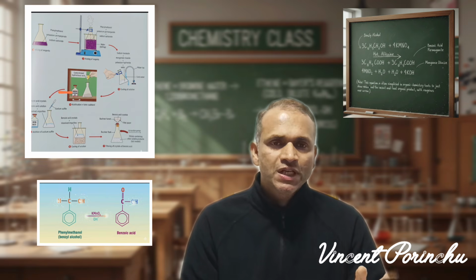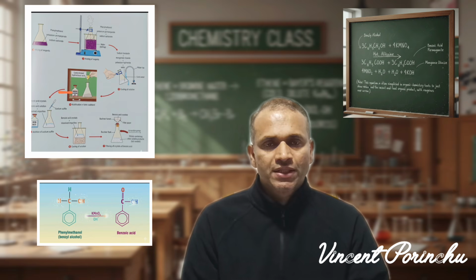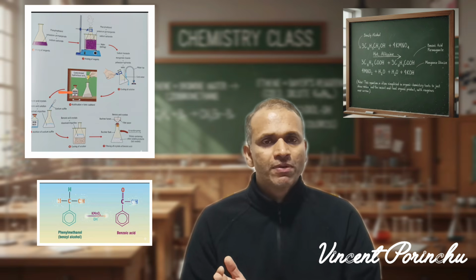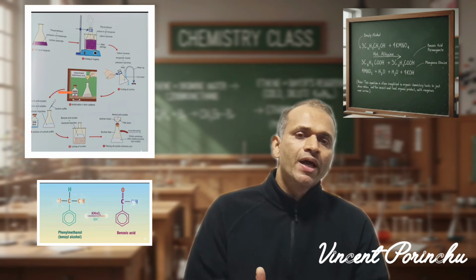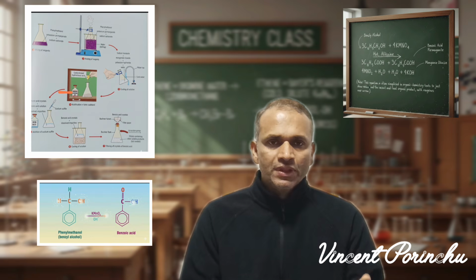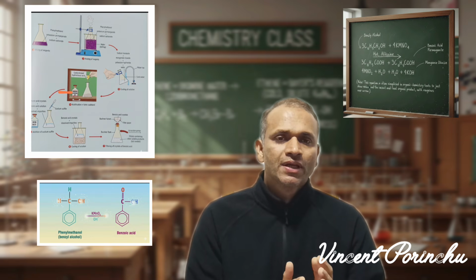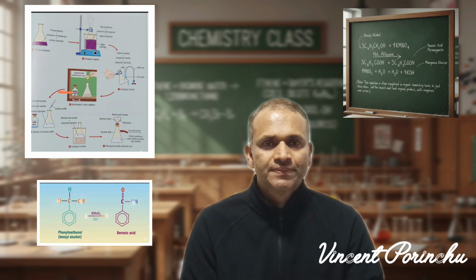This is fully an oxidation reaction, that is the oxidation of benzyl alcohol to benzoic acid. Here we are using 7 steps. The first one is mixing up of reagents. Second one, heating up. Third one, cooling under cold water, I mean tap water. And the fourth step, acidification using concentrated hydrochloric acid. And the fifth step, we are using sodium sulfite. Then the sixth step, we are cooling on an ice bath. And the seventh step, filtration.